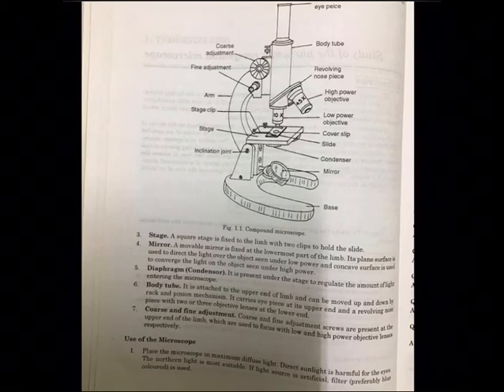So there will be one slide and one specimen in the practical exam, the final exam. So you need to identify. When you identify, you have to write first what it is, and on what basis you are telling that that particular object or that particular slide or section is what you are thinking. So there should be reasoning.